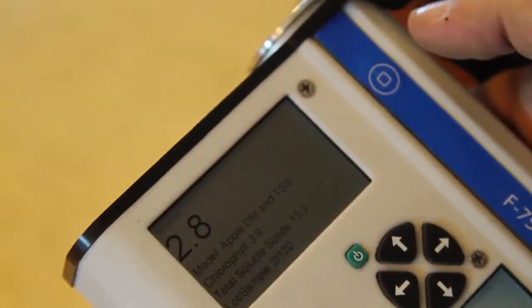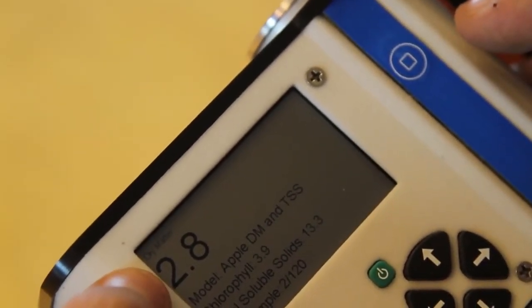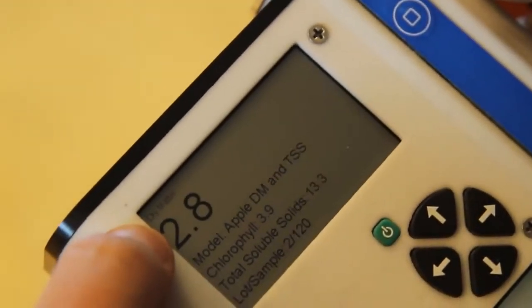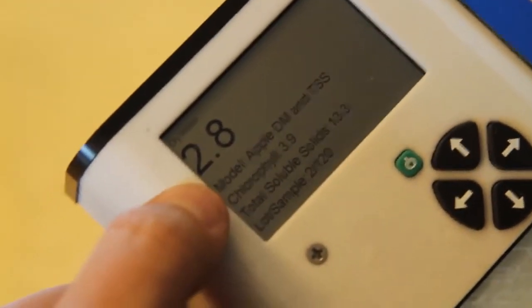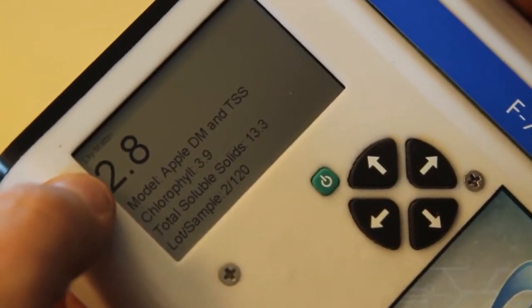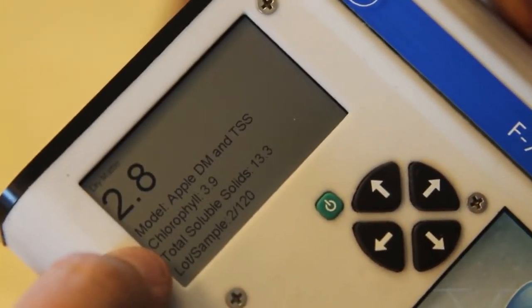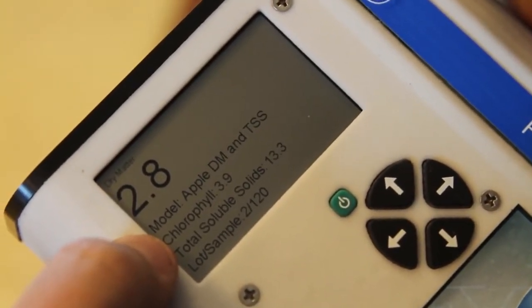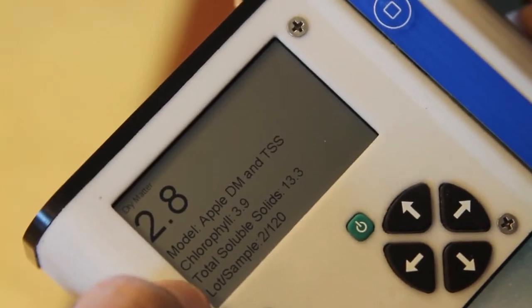As soon as the measurement's made, the instrument displays the data that was recorded and calculated. Here you can see the dry matter score for this apple, along with the chlorophyll index score and the TSS score.